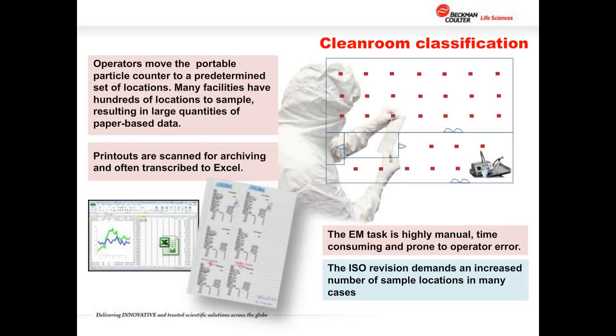So one of the things that is time consuming, of course, always has been the idea of putting the information together on paper tape and creating some sort of permanent file, whether it's a PDF and or typing it maybe into Excel and putting it into an Excel spreadsheet or up into a LIMS. That takes time and increases the risk of a transcription error.